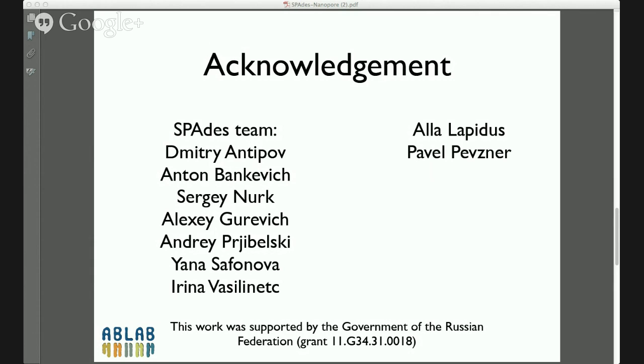So at the time when we had just started the MAP, we'd been running some R6s, and fortunately for us, there was this Salmonella outbreak in Birmingham. Fortunately for us, unfortunately for the patients, it's widely publicised in the press, and it was caused by Salmonella enteritidis. So we decided to go for it, and we thought we'd do some nanopore and some MiSeq sequencing. The same day that we received the samples, we sequenced 16 of them on our MiSeqs using a recipe called draft sequencing, which I wrote for the MiSeq.